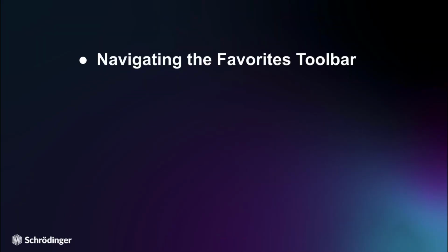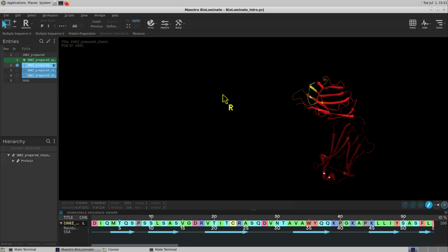In this video, we will go through how to navigate the Favorites toolbar and the Tasks menu. To get us ready for upcoming tasks, let's take a look at how to access various calculations in BioLuminate.